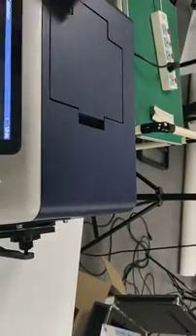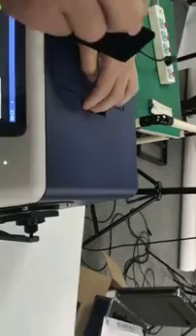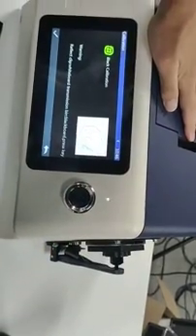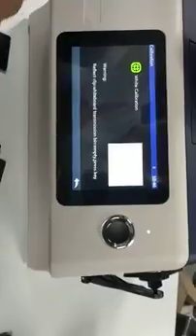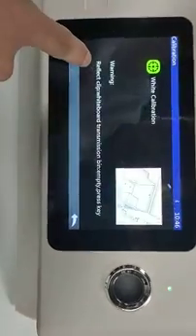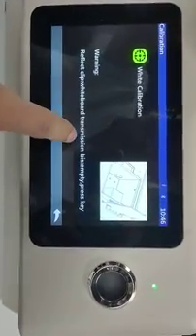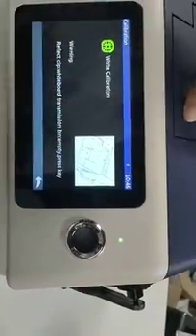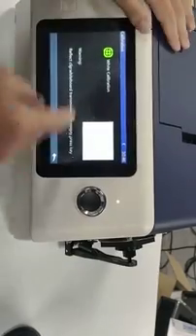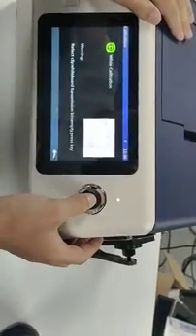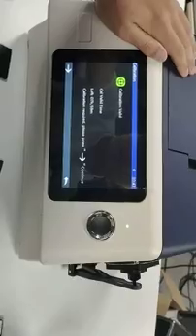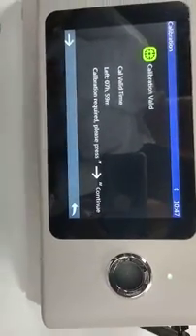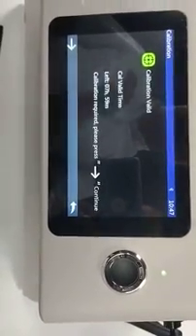This one, here. Here. Ok. Press a button. And reflect chip whiteboard transmission empty. This is the prompt. Ok. White calibration. Ok. The transmission calibration done.